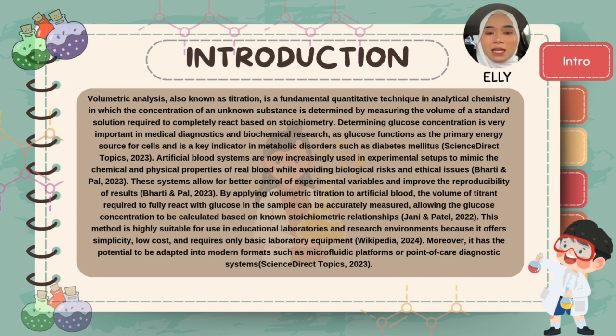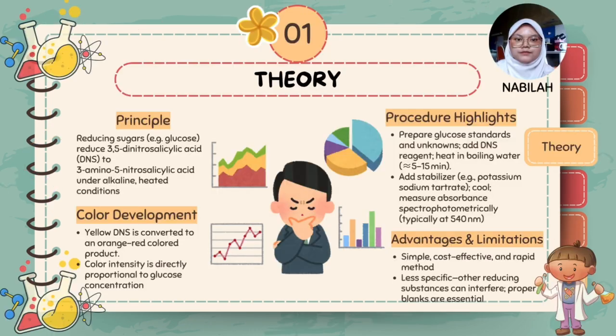This method is highly suitable for use in educational laboratories and research environments because it offers simplicity, low cost, and requires only basic laboratory equipment. Moreover, it has the potential to be adapted into modern formats such as microfluidic platforms or point-of-care diagnostics.